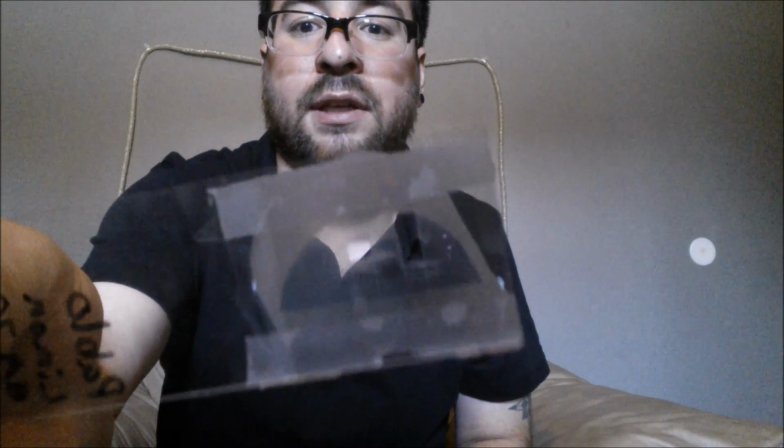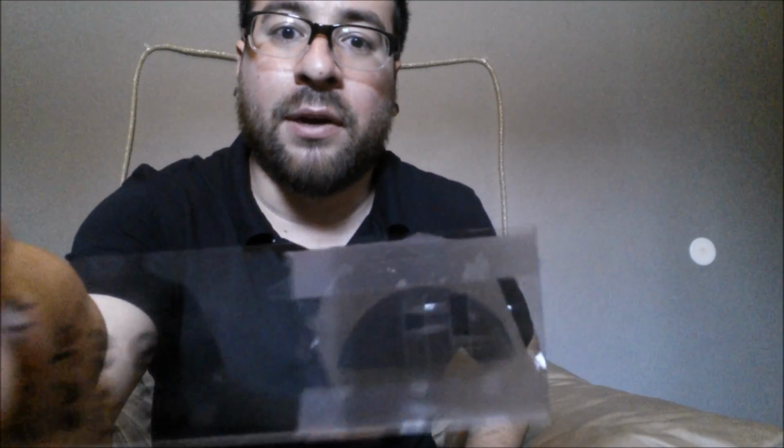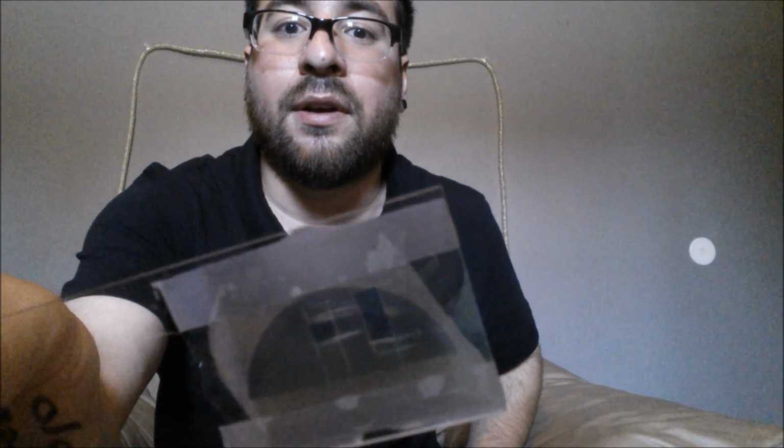This is for a steel replica, because you can't put a big old metal chunk in there, so you make a replica of the steel itself, cut a little strip off of it, and put it on one of those grids. Those grids are stored in this.